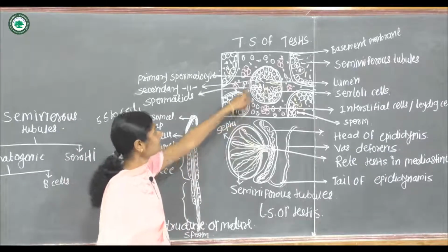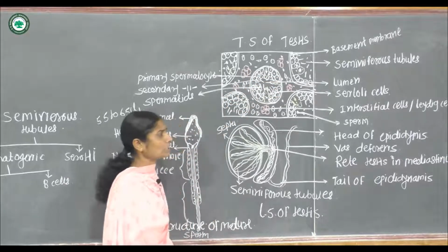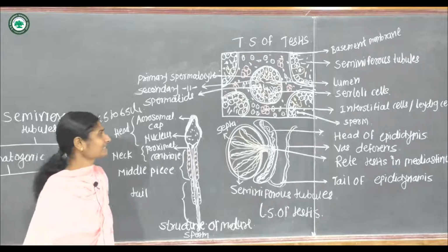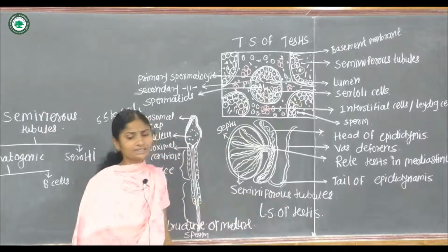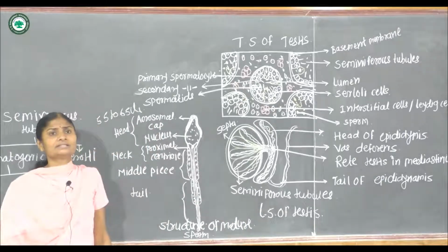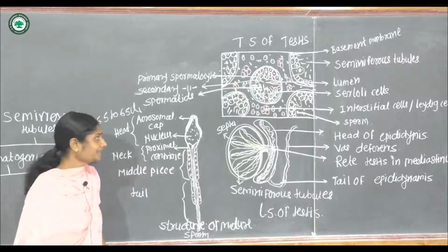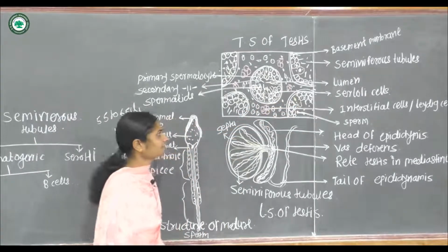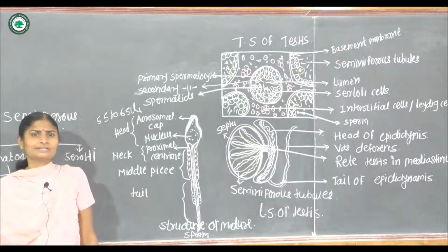A large number of seminiferous tubules are present in the testes, as well as Sertoli cells. These supporting Sertoli cells are present in the testes, and the spermatozoa are attached to the Sertoli cells. These are all about the histology of the testes.